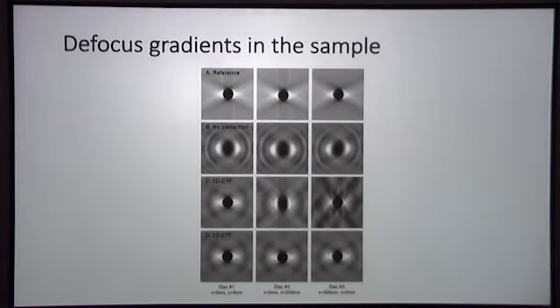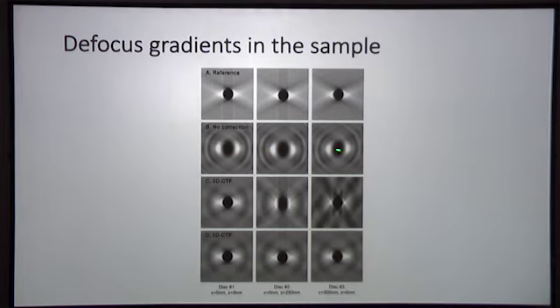So this is the effect of reconstructing beads. This is what the reference image looks like. So this is a simulation based on a tomogram where there is no CTF. This is what happens if you reconstruct your image without doing any CTF correction. You can then see the effects of the CTF on your bead.